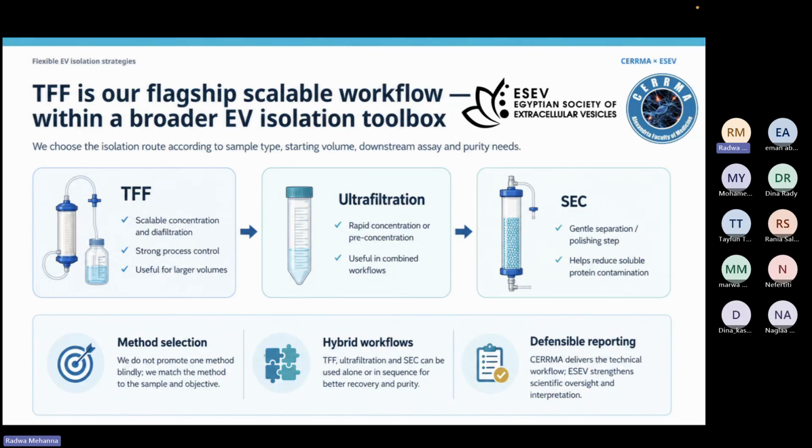And it really has these advantages which were mentioned by Typhon, like the scalability, the strong process control, the use for large volumes. There's no plugging for the filters, but yet we can use the ultrafiltration sometimes when we do not need such purity.